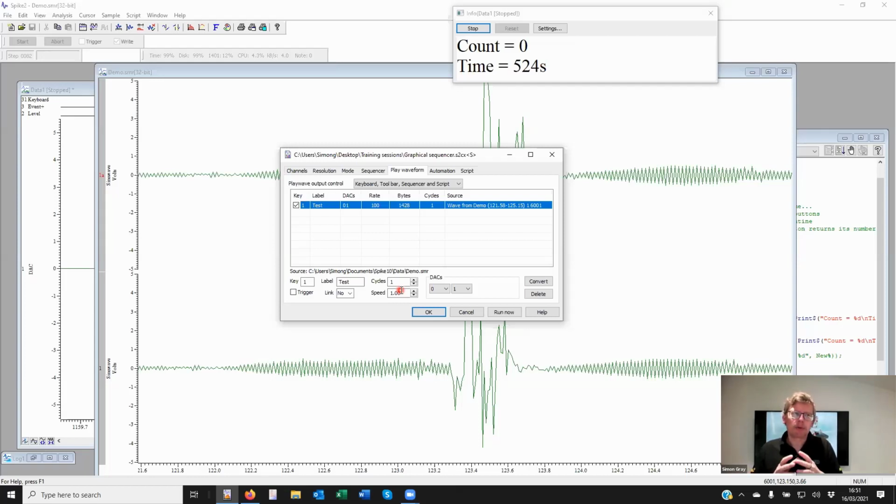So if we wanted to play out, say, a month's worth of recording, okay, it's simply not going to fit into memory. So using a script and two empty memory sections, we could play out one section and then link it to the next. As the second section is playing out, we fill the first section with new data, which is the next part to play. And we simply link these two sections end to end. So like an infinite loop. Right, so that's just a little extra there.